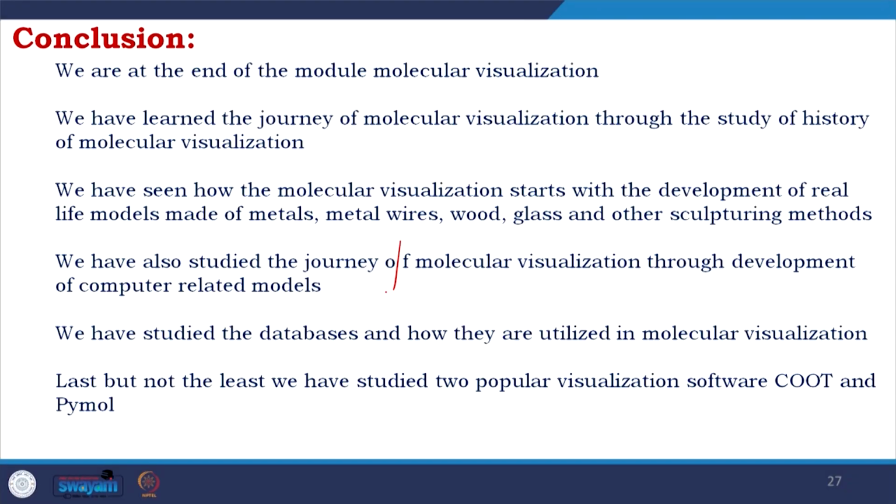And then we have studied different software. We majorly divide them into two parts: one, visualization software with modification; the other, only a visualization platform to make good quality figures and movies, and we have chosen one representative from each.